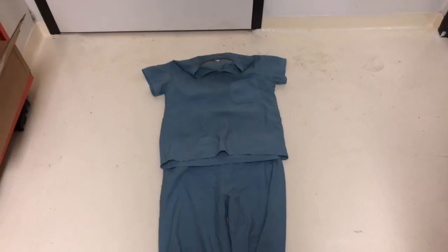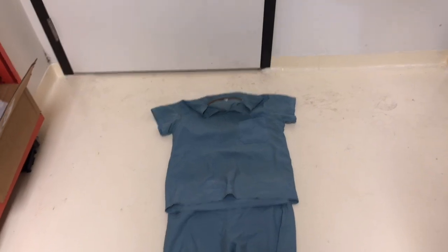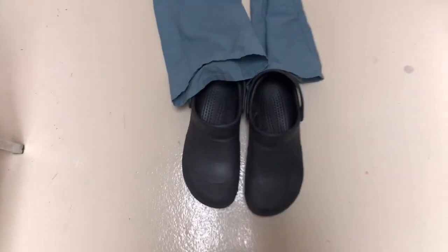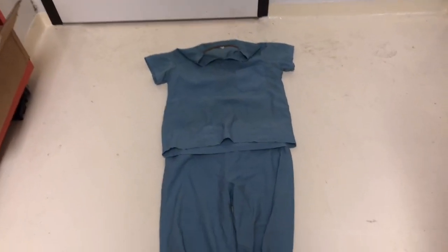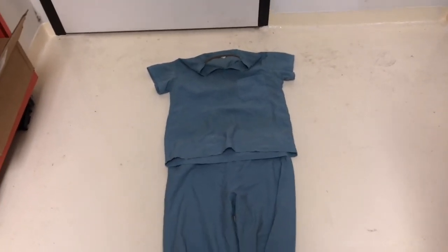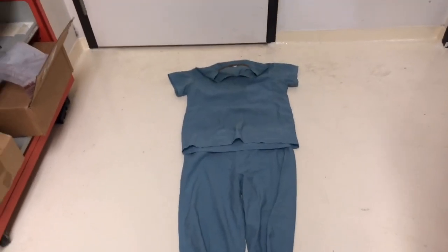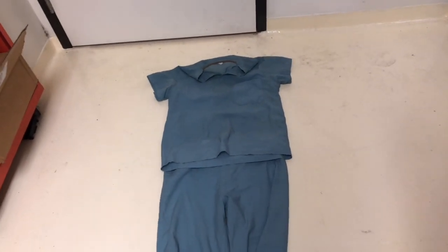The next layers of protection that are important for us are wearing the appropriate PPE. So first up is the fact that no street clothes can enter the BSL-3. We wear scrubs the whole time we're in there. So pretty typical scrubs and Crocs, and I hate wearing Crocs, so I always point that out. But this means we have 1 layer of protection should anything go wrong. Should we rip our suit or anything like that? Not that this happens, but we are not wearing clothes that we could then take out and contaminate the environment with. We wear clothes that we can very easily destroy and replace, should we need to.